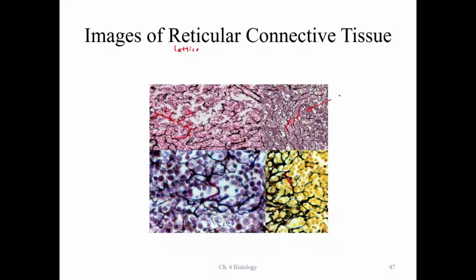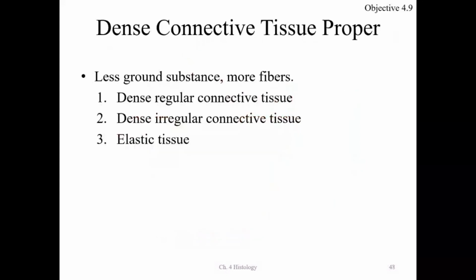Then we have all this cell pulp, all these little cells. Lots and lots of pulp with few of these reticular fibers. So there's lots of cell pulp, okay, and reticular fibers are present. We can easily see these, okay? That's why I'm highlighting some of the fibers so you can get the characteristics down, okay? Cell pulp and reticular fibers.